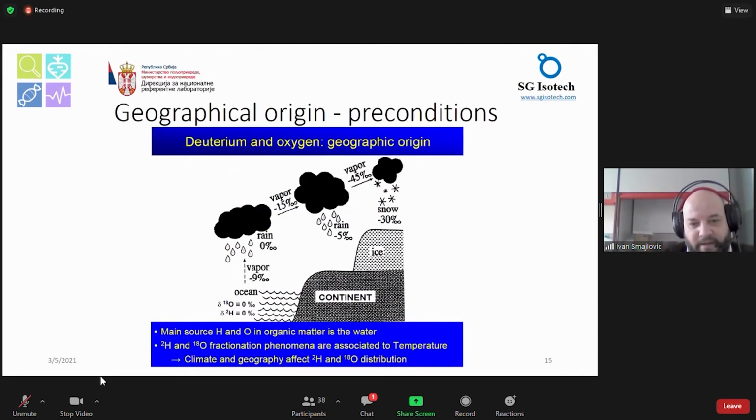So, to come back to oxygen and isotopic fractionation. Ocean water is our reference because it is a huge amount of water and it is somehow equilibrated. The water cycle in nature gives us information on where something was produced. We have natural evaporation of water in the water cycle, water becomes water vapor, then the vapor condenses and makes clouds, and clouds make rain, and rain drops back to the ground. But clouds are going from the equator up north to the north and south pole.